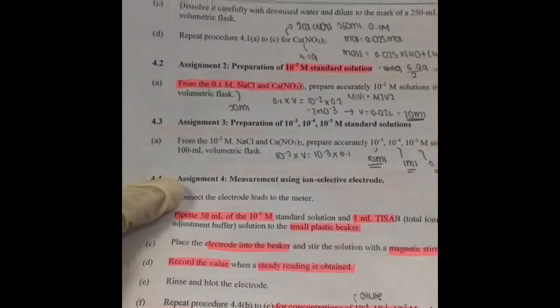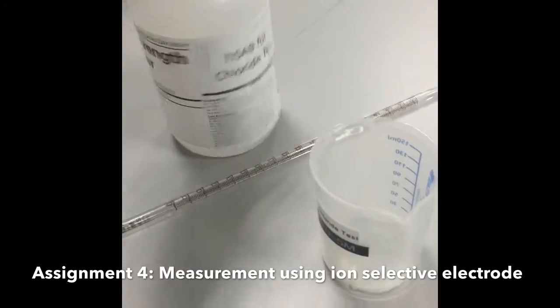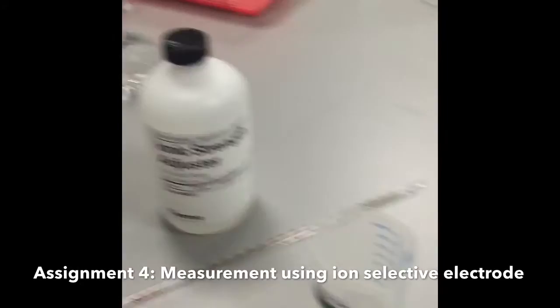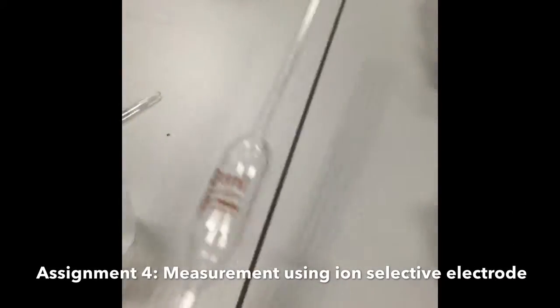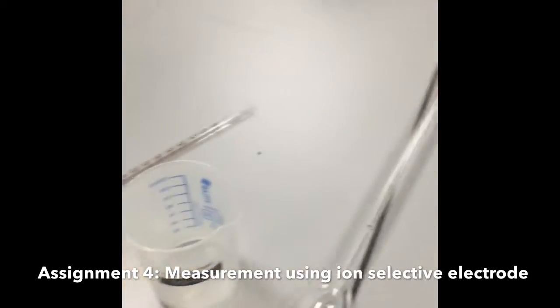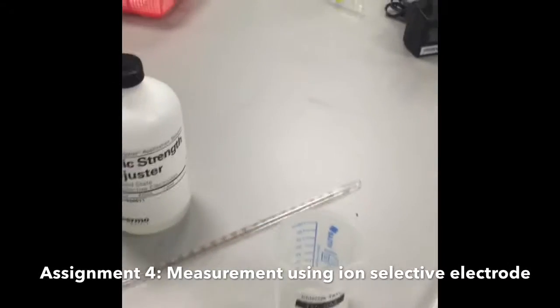Okay, assignment 4 is measurement using the ion selective electrode. Basically you need this TISAB for the chloride test, which is the ionic strength adjuster, 1 ml. Also, remember the 10 to the power negative 5 chloride solution that you previously pipetted and diluted. Basically you need a 50 ml pipette to pipette it into this small beaker. After you have done so, pipette 1 ml of the ionic strength adjuster and mix them together. Okay?